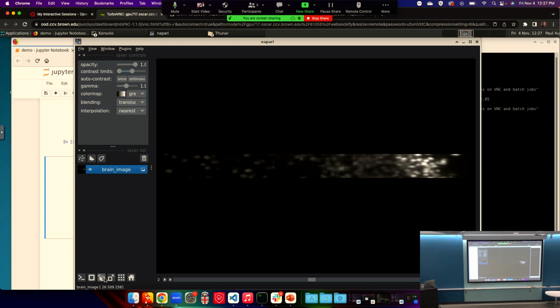All right. There's a few other things you can choose as well. For example, you can transpose the axes, and once you're done, you can go back to your original view.